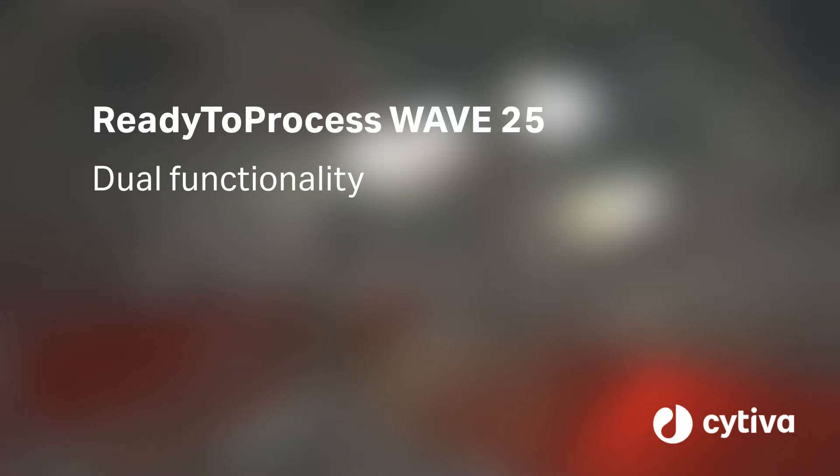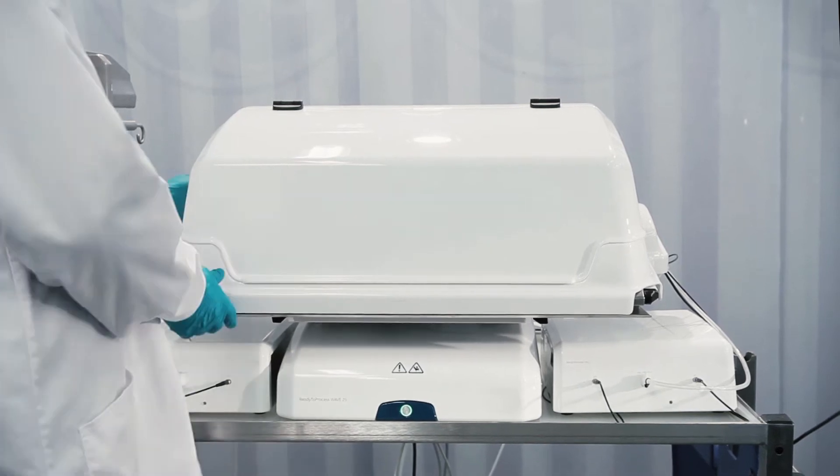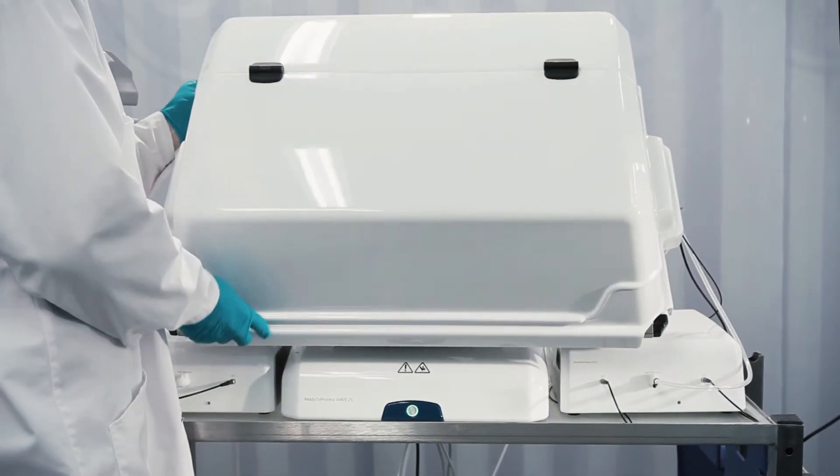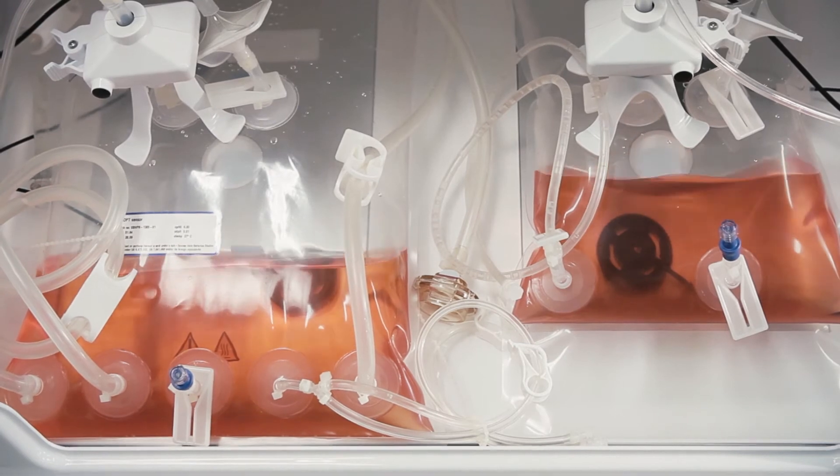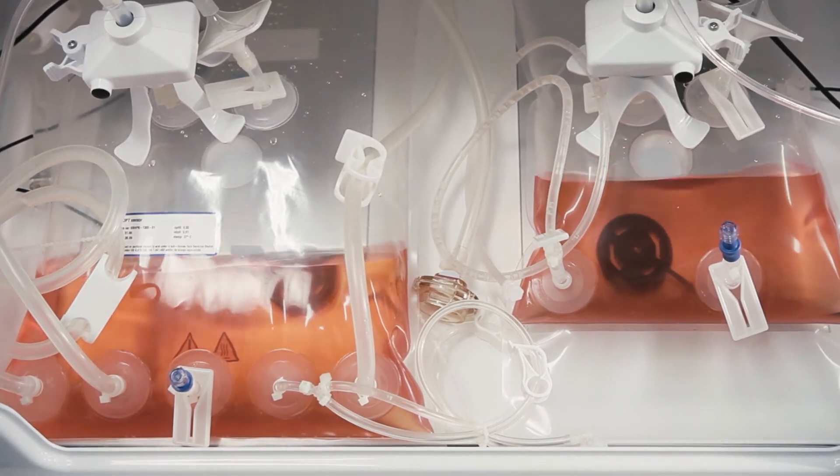When operated in dual mode, culturing can be performed in two separate cell bag bioreactors simultaneously, using the same or different bag sizes or working volumes.